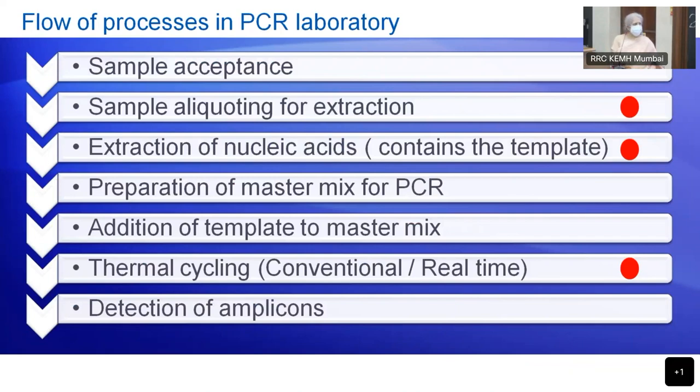You must have heard multiple sessions on quality control, right? By now you're much more of an expert than I probably ever was. This whole workshop is about quality control, and the certification is about quality control. So we need to have quality at every step of the process. The flow of processes in a PCR laboratory will be simple, right?